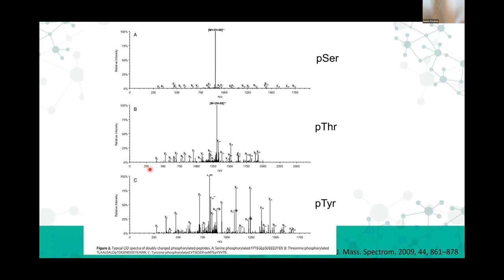So when you put energy into the peptide, instead of fragmenting along the peptide backbone to get these nice Y and B ions, most of the energy goes into kicking out this phospho group. Now most of the remaining ion in that peptide is this loss of phosphate.